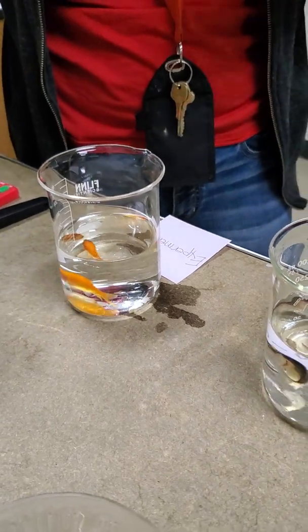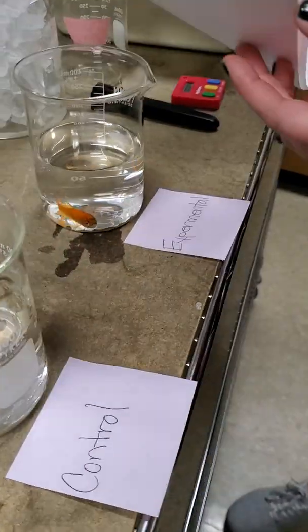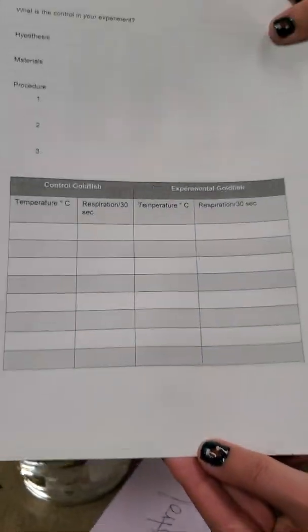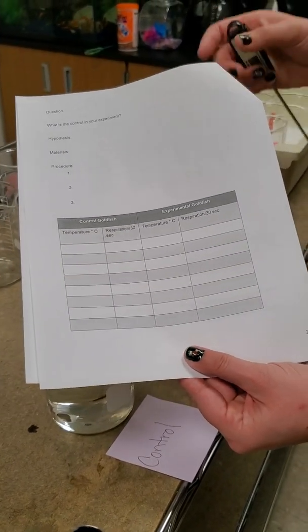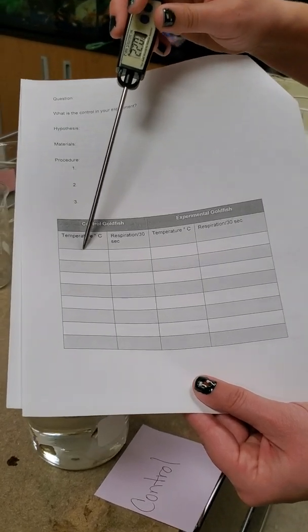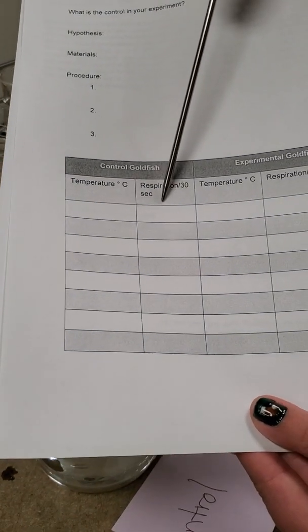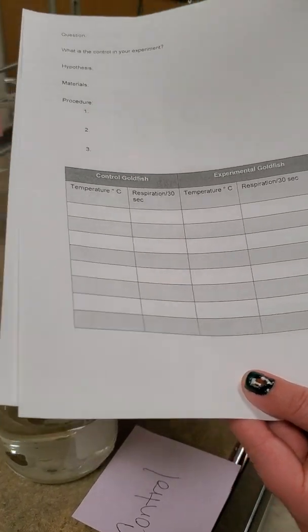So we are going to start with a baseline. We have our control fish here and our experimental fish here. You should have a graph that looks like this on your document. I want you to record these numbers: the baseline temperature and then the respirations for the control goldfish and the experimental goldfish.